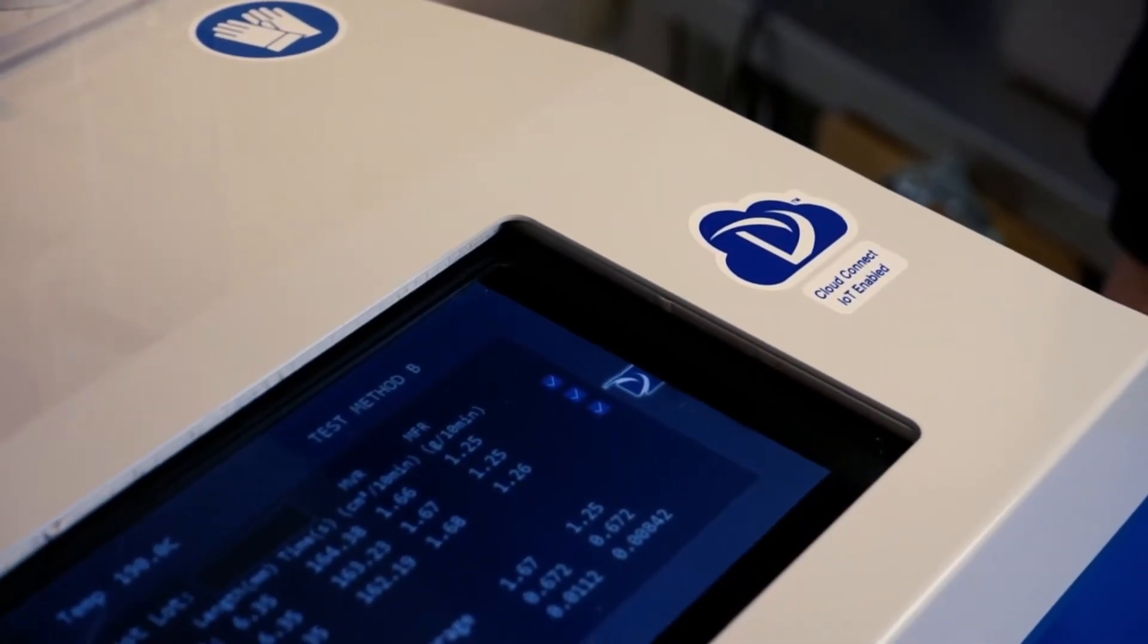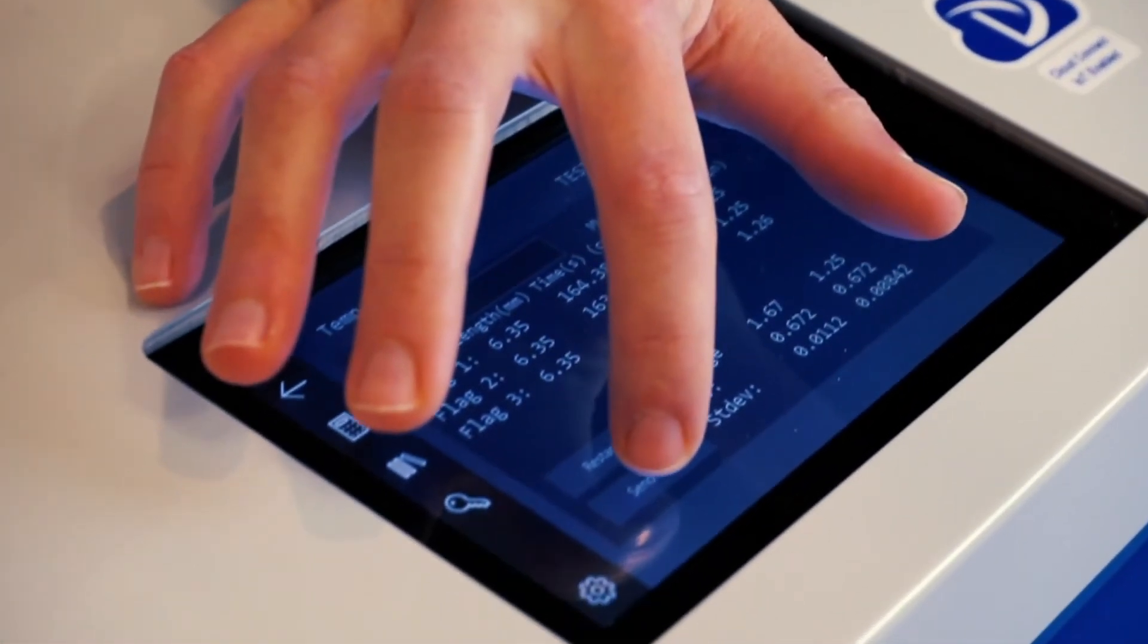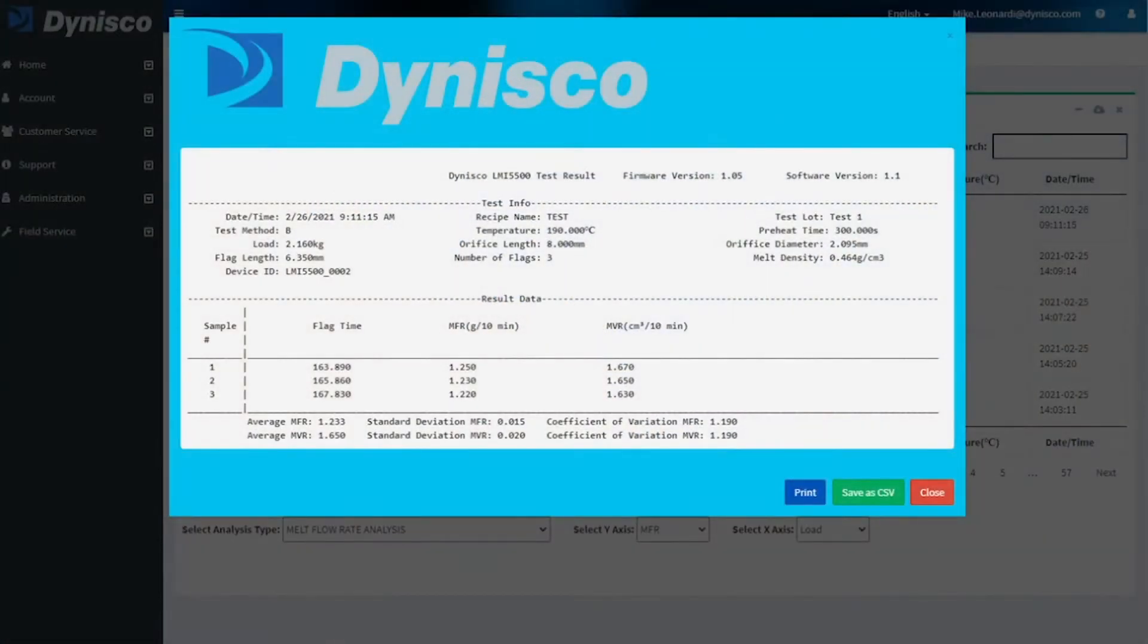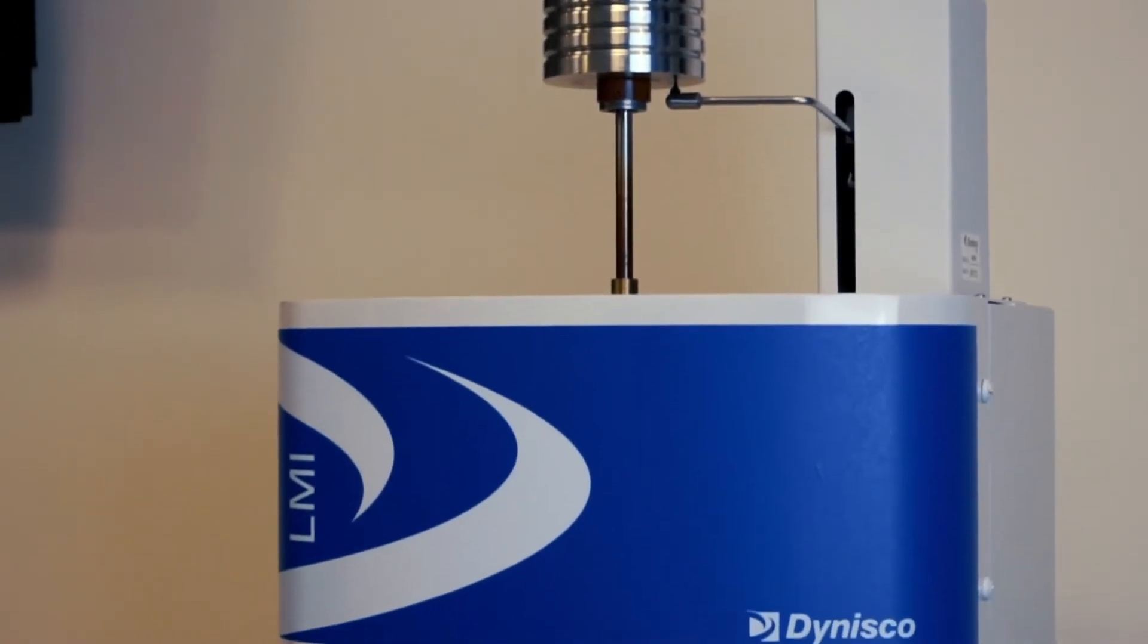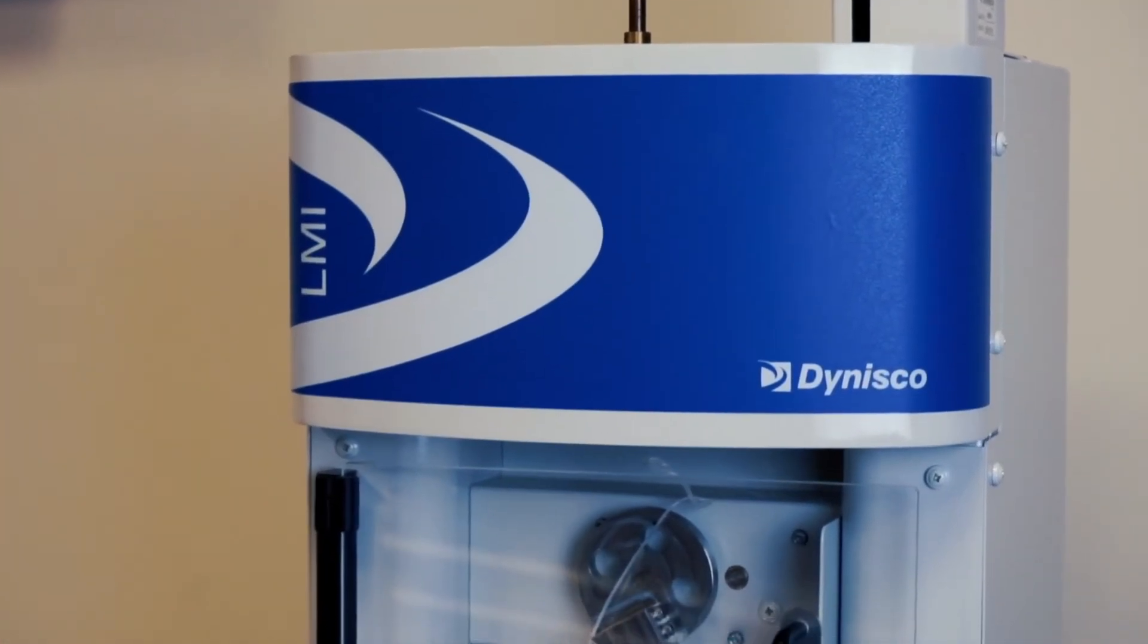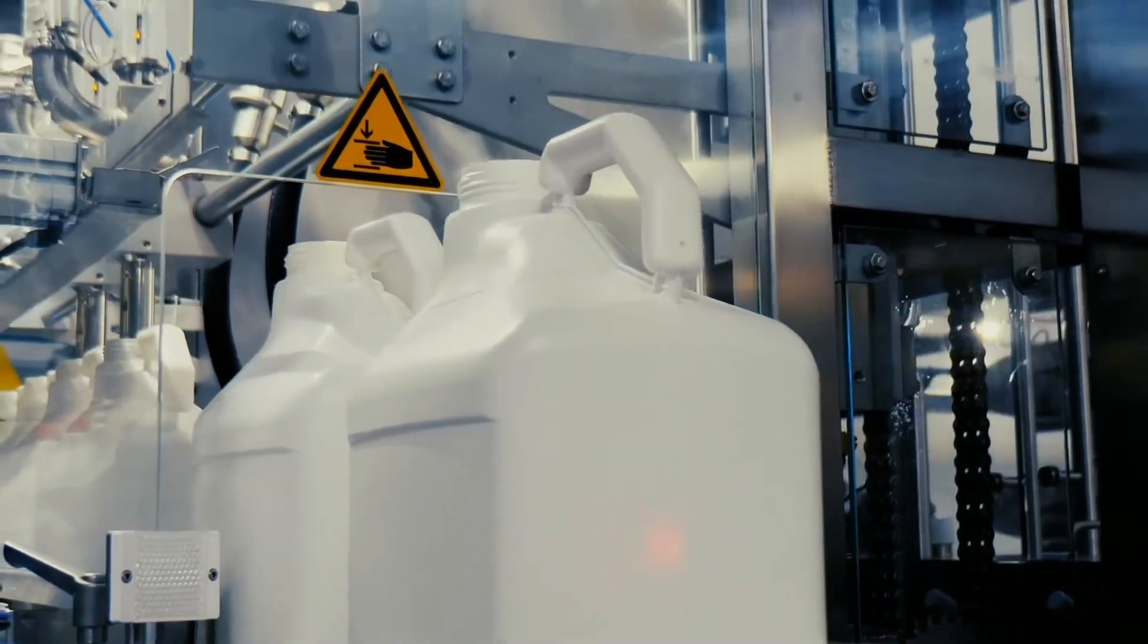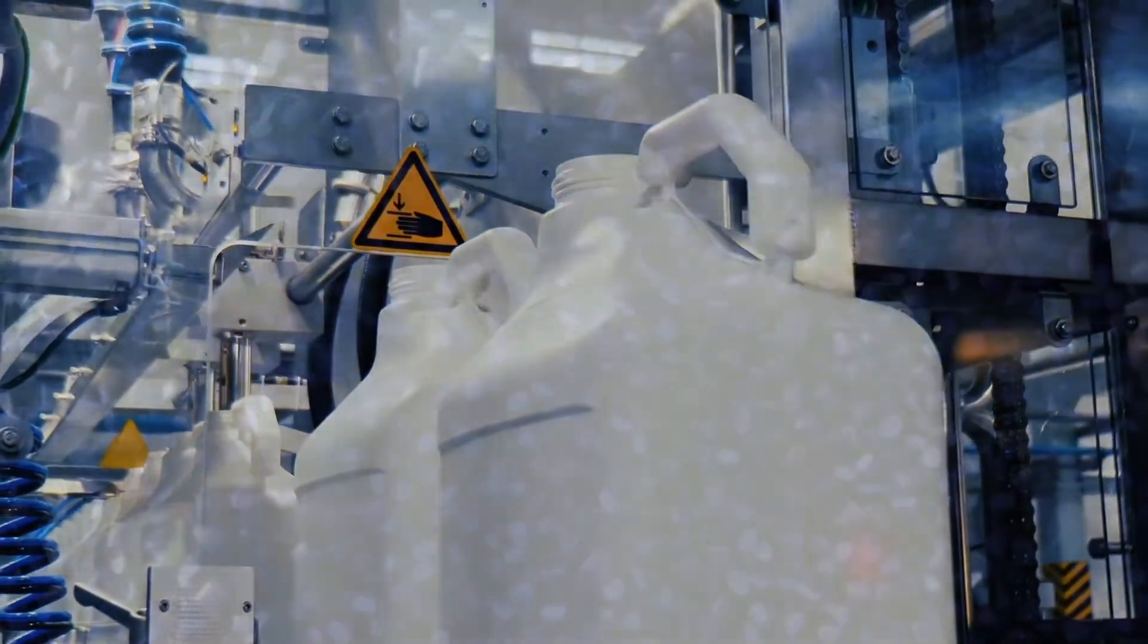Upon completion, test results are viewable and can be sent to the cloud, enabling you to track results over time as well as other advantages. Using the Method B test, high levels of efficiency can be maintained during production, while still achieving a quality product within your specification.